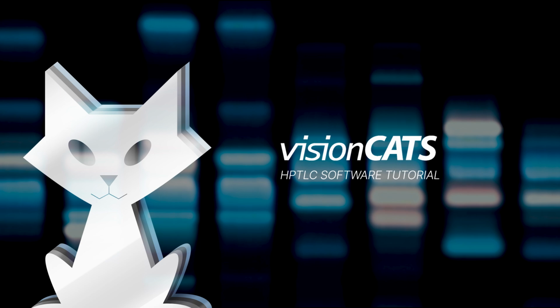Welcome! In this tutorial, we will explain the related substances functionality in visionCATS, which enables the quantification of impurities by applying the calibration model of a designated main substance. This approach is commonly used in pharmaceutical analysis, where the main substance represents the active pharmaceutical ingredient, or API, and impurities are classified as related substances.